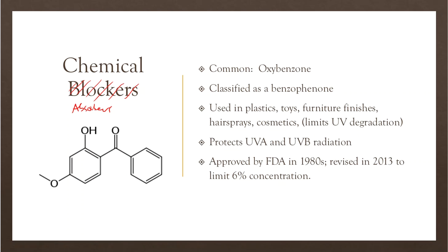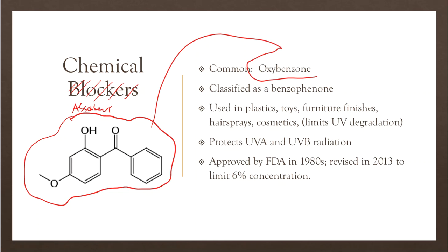And what you're seeing on the screen right now is one of those classifications, or one of those molecules. And this molecule is going to be called oxybenzone. So this is what this lab is going to be focused on. We are going to look at sunscreens and we're going to extract the amount of oxybenzone, if it has any, from that formulation, and we're going to inject that onto an HPLC instrument, and we're going to measure how much oxybenzone really is present in that product.